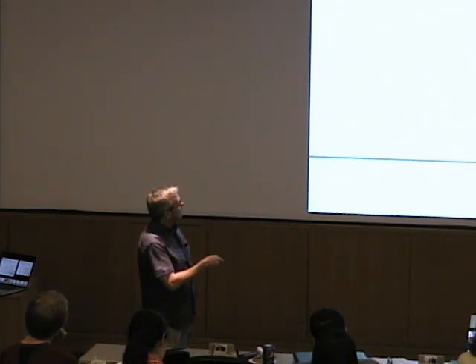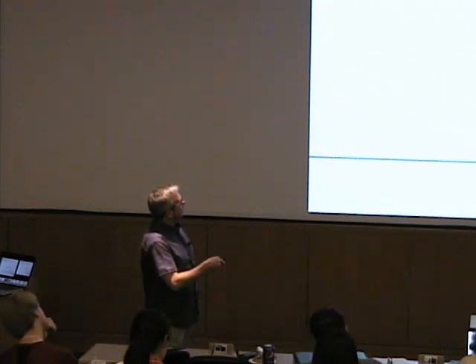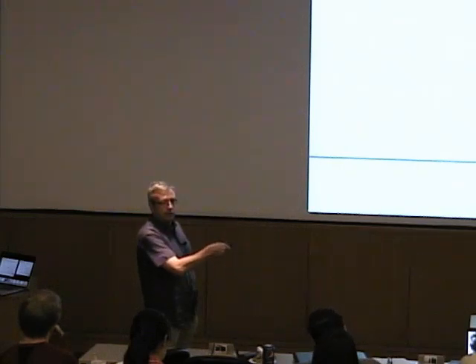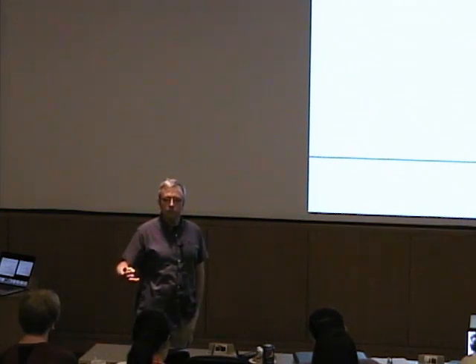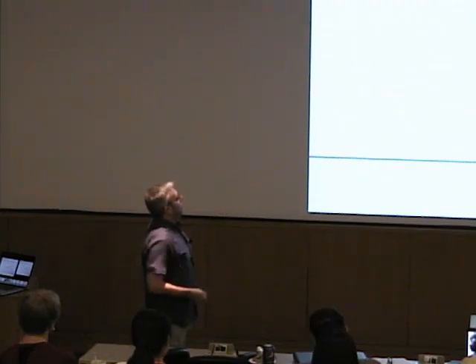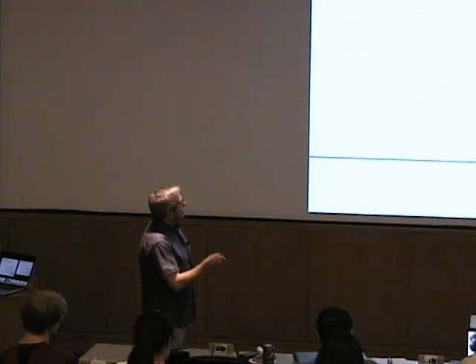If this is a reflection, then this reflection must come from this set of lattice planes so that you have this angle theta going in and coming out, which also means that this angle is 2 theta. If you look at small molecule structures, 2 theta is how they tell you their resolution. You get a 2 theta angle. It's that one.